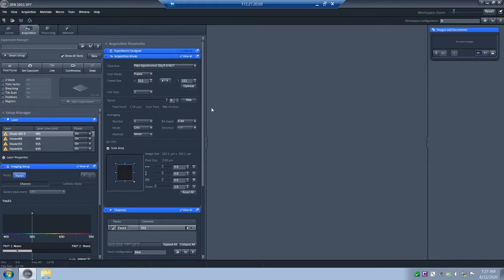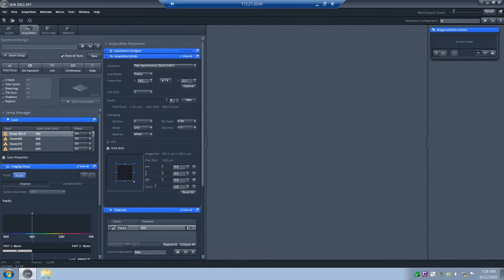One note about the recording of the screen: you'll see a few things that look a bit odd, and the screen seems smaller than it does when you're on the microscope. That's because the only way I can record this video directly of the screen is by remoting into the microscope computer from my own laptop, so I'm limited by screen real estate. It'll look slightly different, but you'll have all the same options — just bigger when you're actually sitting in front of the microscope.